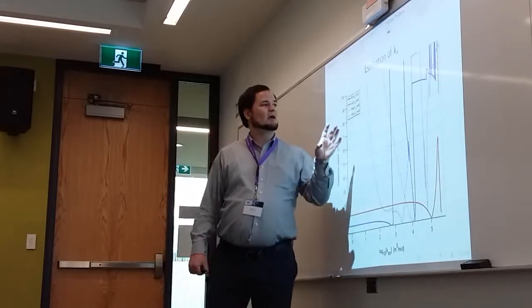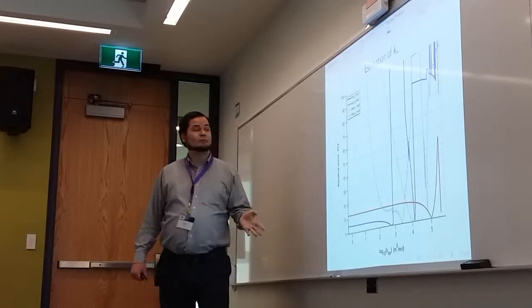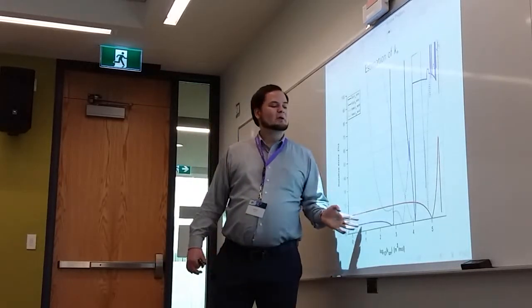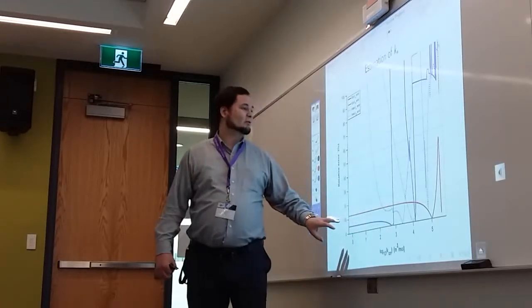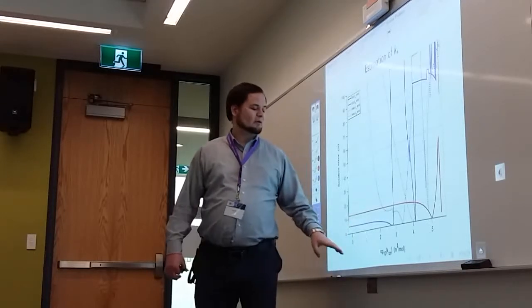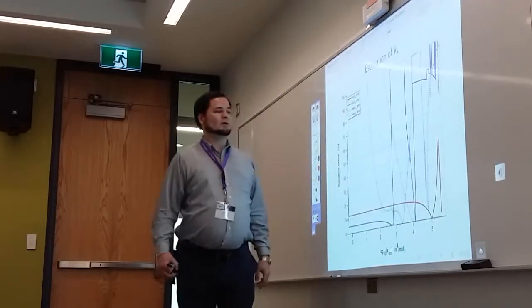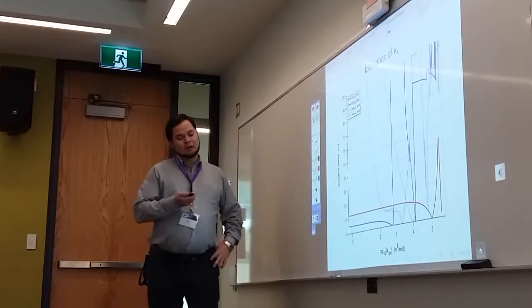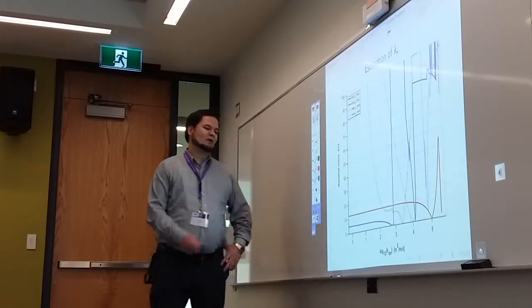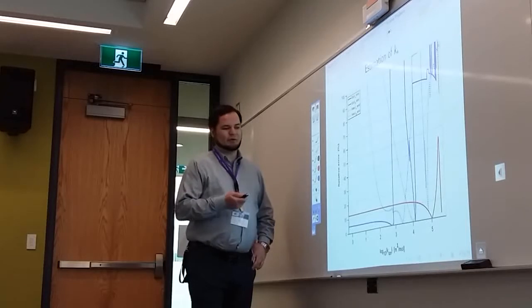But if we execute my method and the area method for a simulated, so a perfect signal, then this is what we get: a near constant, very low error for different K-ons, and the dashed lines are for the earlier area method. At least for this parameter range, this is what I got. It wasn't especially pre-selected, I just chose some standard parameters.